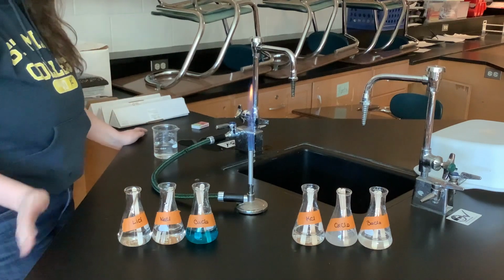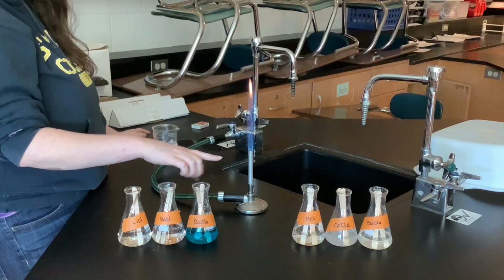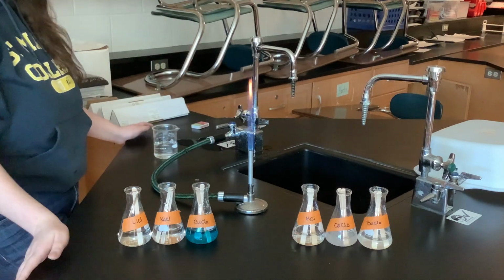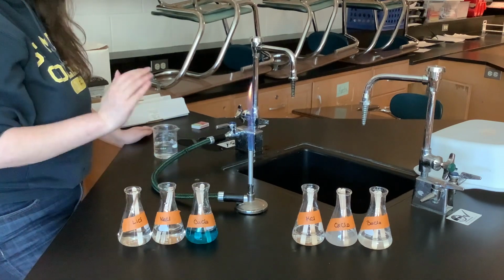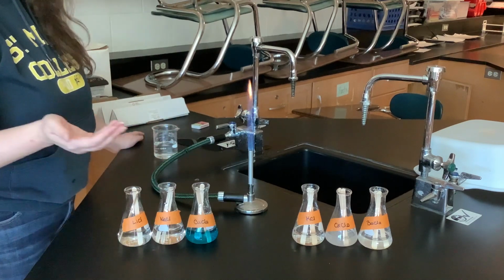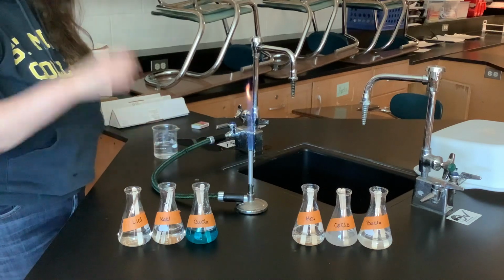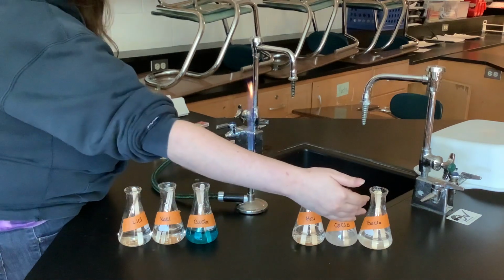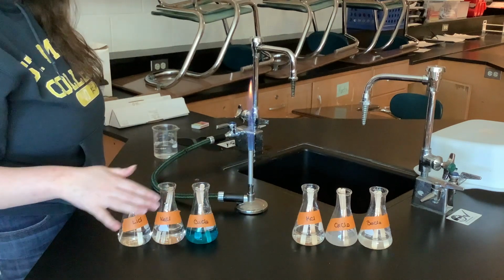Now notice that this flame is currently a light blue down the bottom, a little darker up top, and there's a yellow just at the teeny tiny top there. Ideally this flame would be entirely blue and a bit smaller, but this Bunsen burner won't let me adjust it lower. So we can make this work. I'm gonna burn everything near the bottom because that's where the heat is the hottest. I'm also gonna start from this end and work my way this way because the ones on this end have been soaking longer. So that'll give us the best soak time.